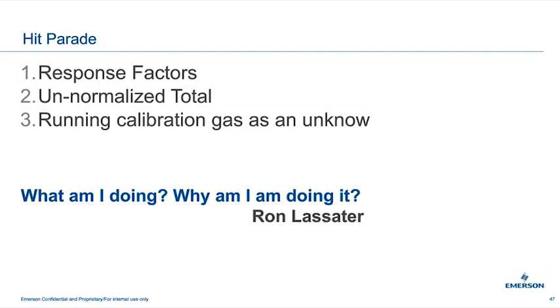So the hit parade is response factors. The second one is unnormalized total, and that goes back to pressure changes. And then running the calibration gas as an unknown will be talked about on June 12th when we talk about calibration gases.